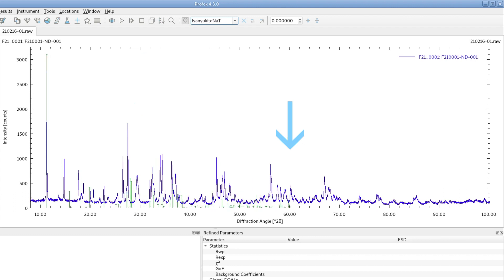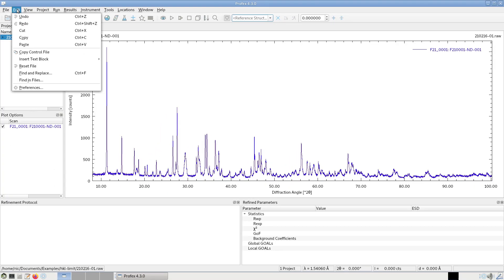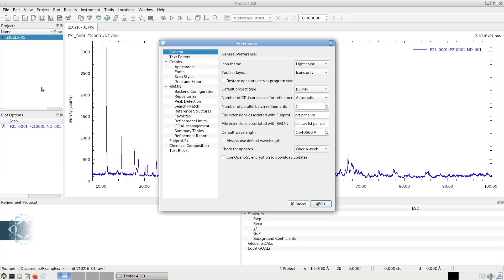This is just a default setting in Profex and can easily be changed if you want them to go up to higher angles. I will show you how to do this. We go to Edit, Preferences.